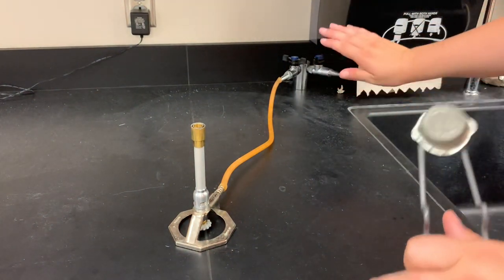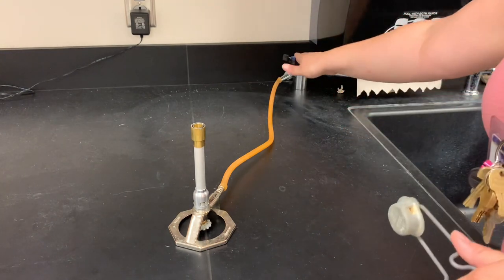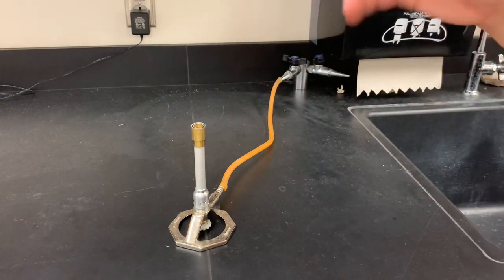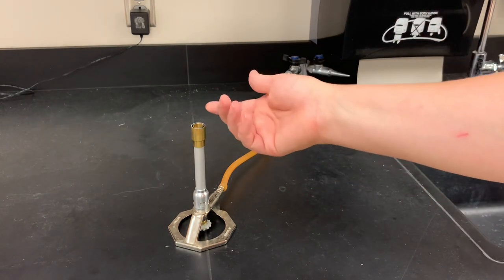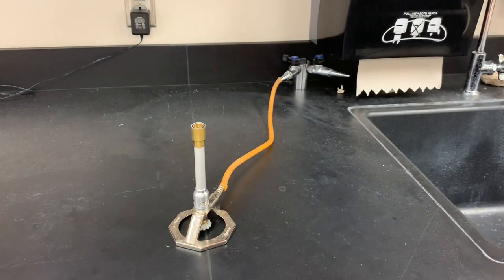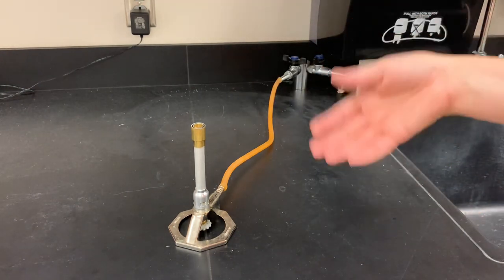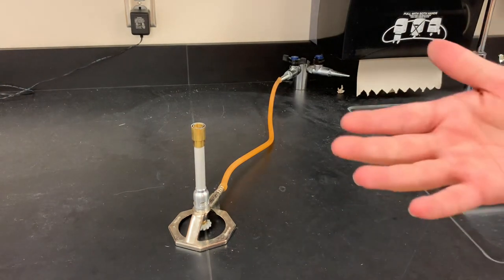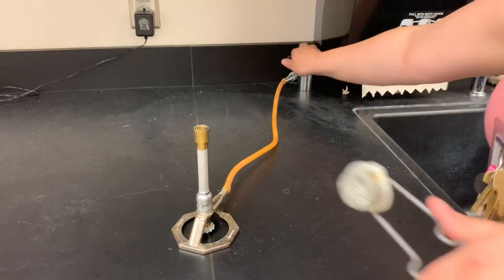When you do this in class you're going to have two people: one person on the gas, one person on the striker. Be a little careful with the gas valve — if you have it on too high, the Bunsen burner will light but then blow itself right back out because the gas is moving too fast. If it's not on high enough, it won't light because there isn't enough flammable fuel.